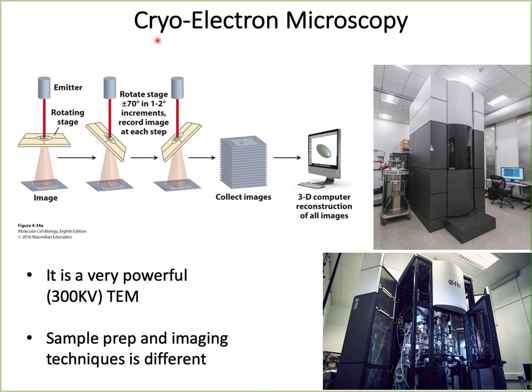The ice transforms into that kind of material by this quick freezing in liquid nitrogen. Then we load the sample onto the specimen holder, and this is constantly kept near liquid nitrogen temperature, and it is kept in a high vacuum. Remember that the chamber where the electron beams are passing needs to be in a high vacuum because any air will deflect the beams.